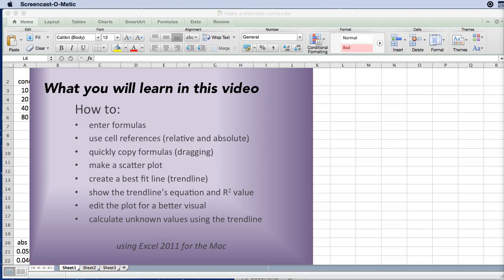Hello and welcome to making and using a standard curve in Excel. In this video you're going to learn how to make and use standard curves to determine the amounts or concentrations of some substance that you are measuring indirectly.